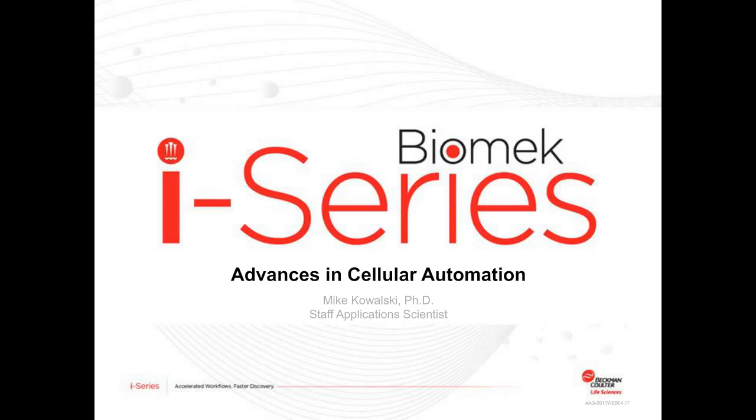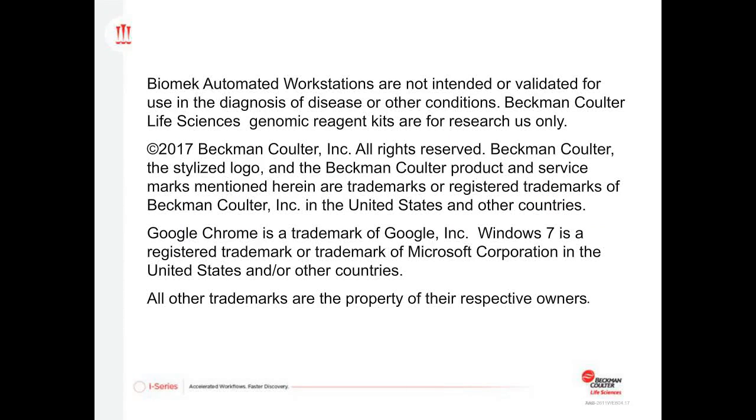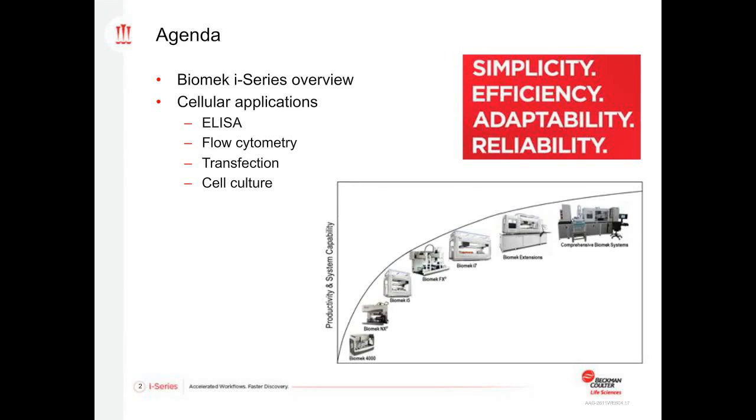All right, thank you, Judy, for the introduction, and thank you, everyone, for attending today. As Judy mentioned, I'll be talking about some of the work we've done to automate cellular applications using our new Biomek i-Series. Before we begin, we do have a few disclosures to show, and we'll now move on to the actual talk itself.